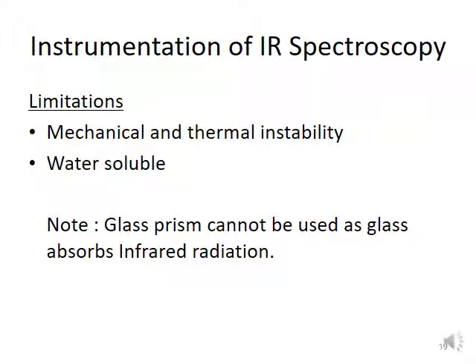So as you all know, in the infrared spectroscopy there is no temperature control. So this is the main cause: when you use a very high temperature, it will make the energy become unstable. So this is another problem that always occurs when you run the infrared spectroscopy.